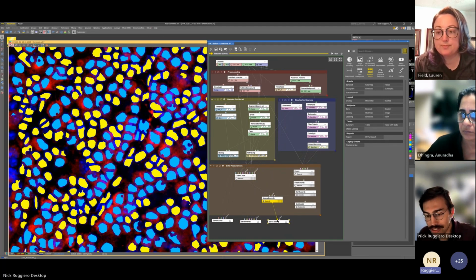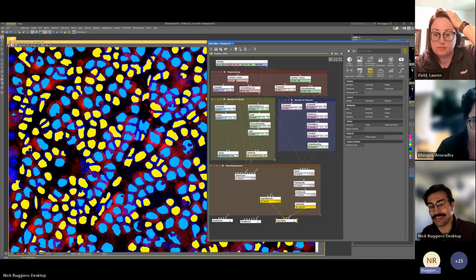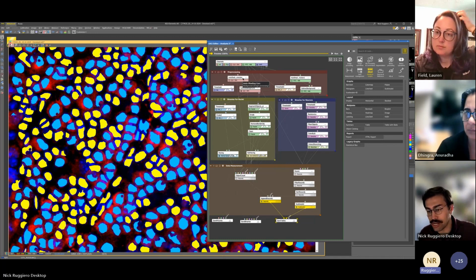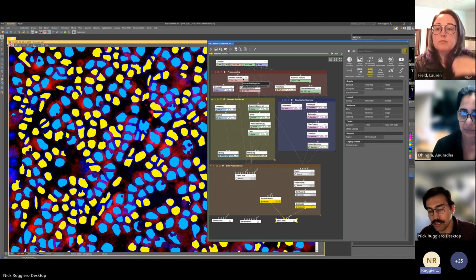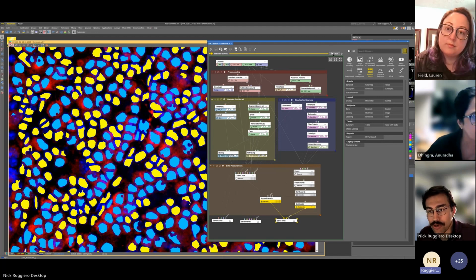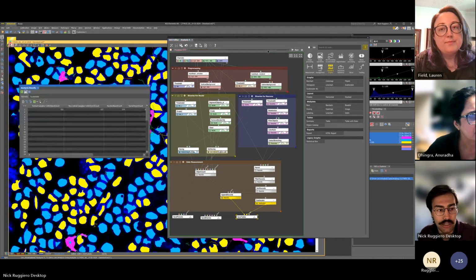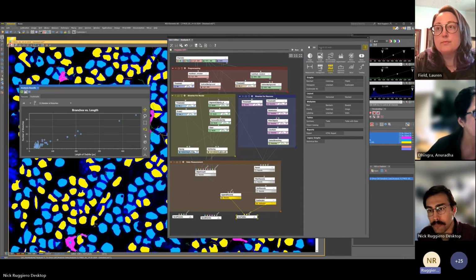So here it's currently just saving this table, but I might also want to save the scatter plot. So I can put that scatter plot here. And this is now a fully formed GA3 recipe, or fully formed for what I decided to do. If I were to save this, all you have to do at this point is hit run, and it will spit out all this data for you. Hit run. It'll create our binaries. It will pull up our analysis and our scatter plot.